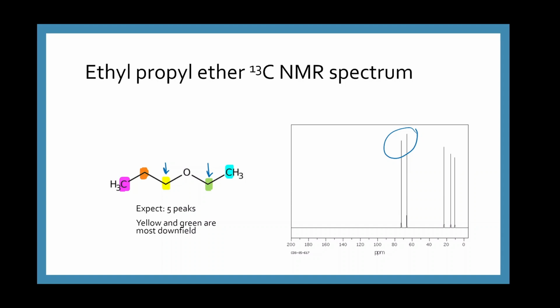And then to tell the difference between the CH3 that's blue, the pink, and the orange, that would be difficult for us at our level. So you won't be doing that for our class without any additional information.